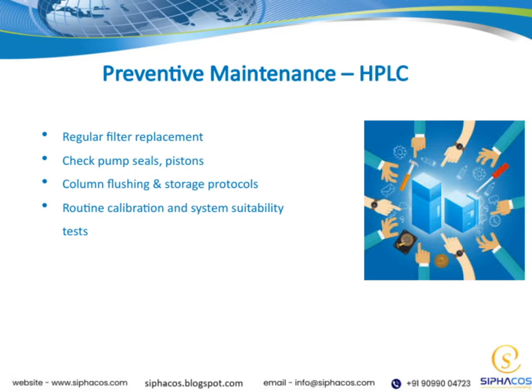Let's start by emphasizing the importance of regular filter replacement. Changing filters routinely helps maintain optimal system performance and prevents contamination. Next, it's crucial to check the pump seals and pistons regularly. Ensuring these components are in good condition helps avoid leaks and maintains pressure stability, which is vital for accurate results.